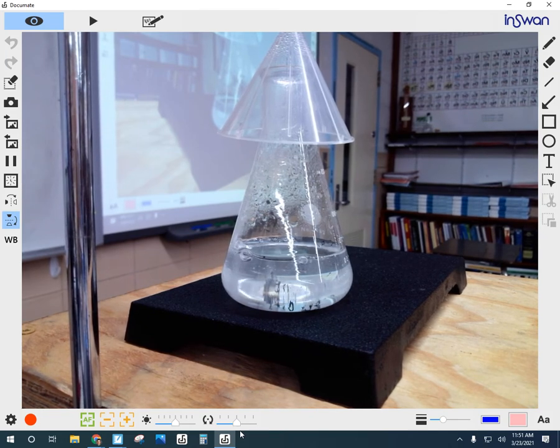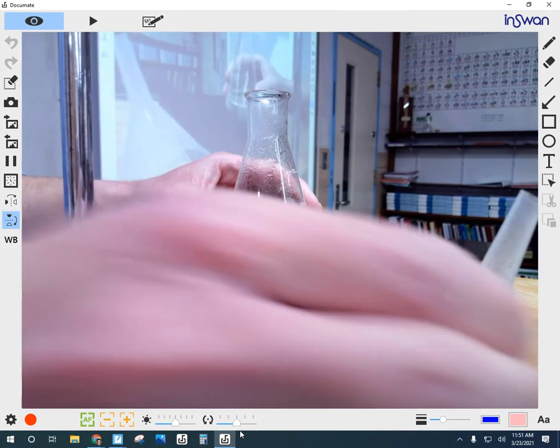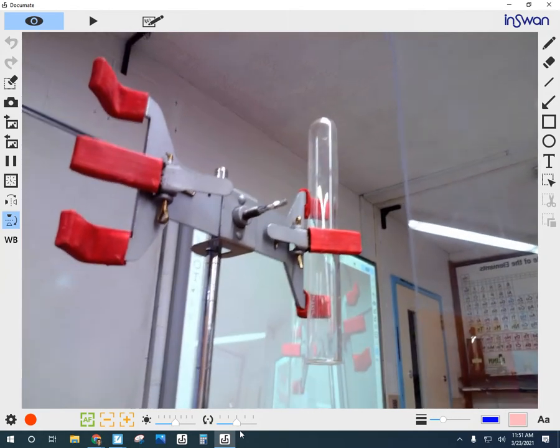I will say I've done this. This is my 4th time today. The first 2 times it worked beautifully. The 3rd time you could see that water vapor formed, but there was no pop, no ignition. So we'll have to see which way it goes this time. Go ahead and move that out of the way. So you can see the test tube.